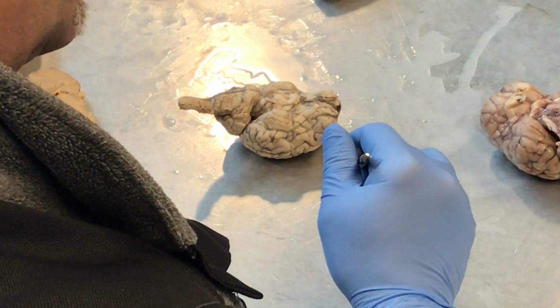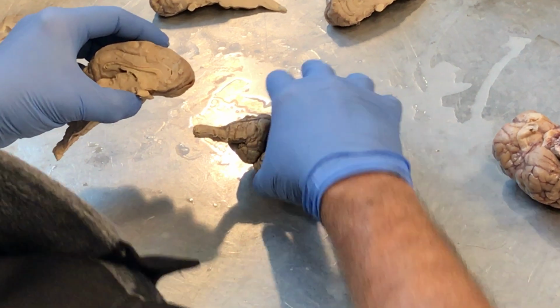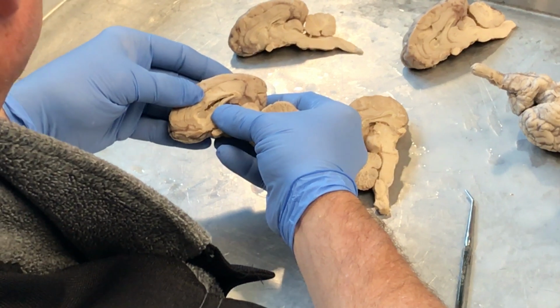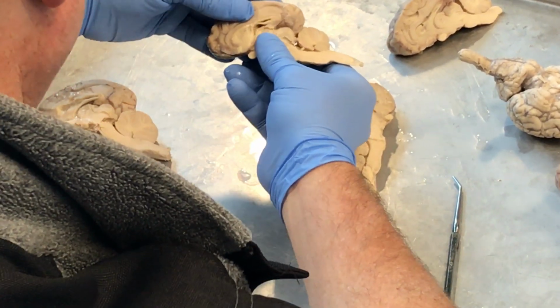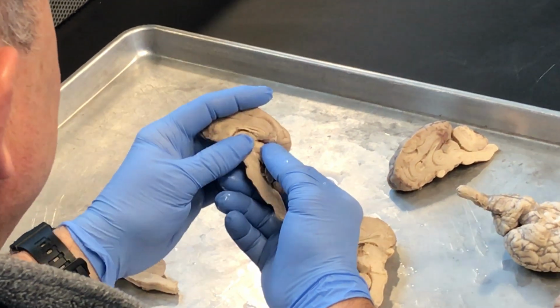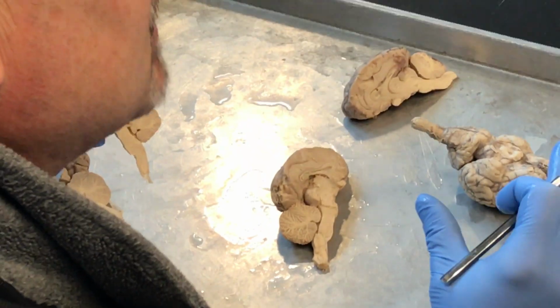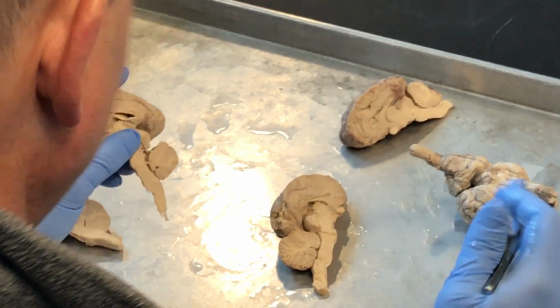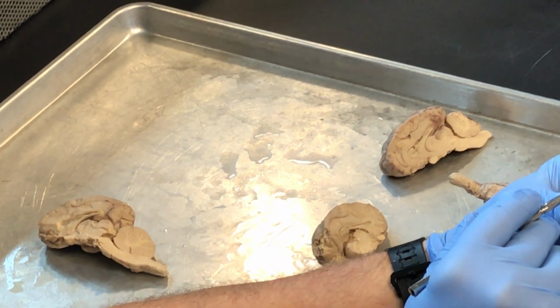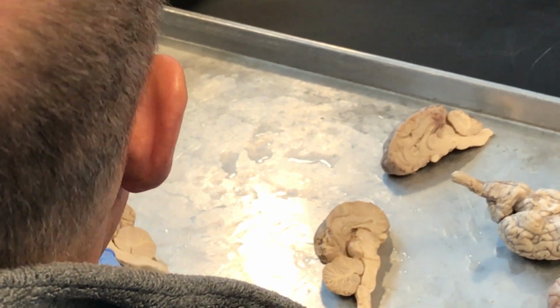All right, so now we want to go to internal structures. We talk about the corpus callosum. That's not too bad. In order to talk about the corpus callosum and the fornix, we need to talk about the ventricle. A ventricle is a space inside the brain. Does that look like a space inside the brain to y'all over there? How about that right there? Look like a space? This is called the lateral ventricle, of which there are two.